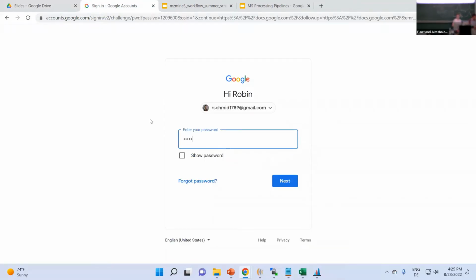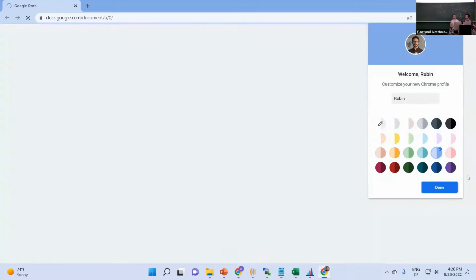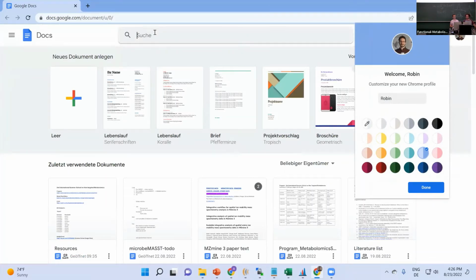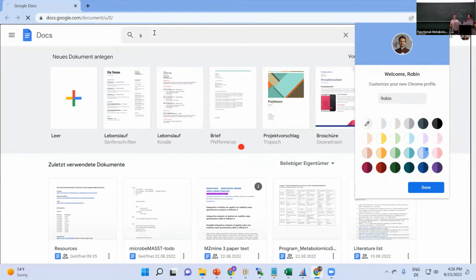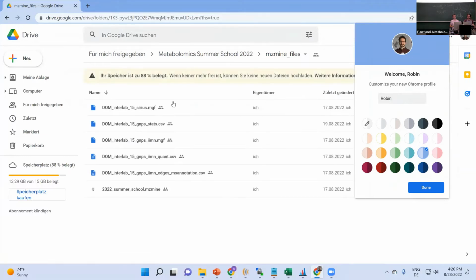Yeah, I just wanted to show that you should have actually. Okay. What? No. Oh my God, they actually changed so much. Okay, so you should, in your folder and on Massive, actually find the metadata file.